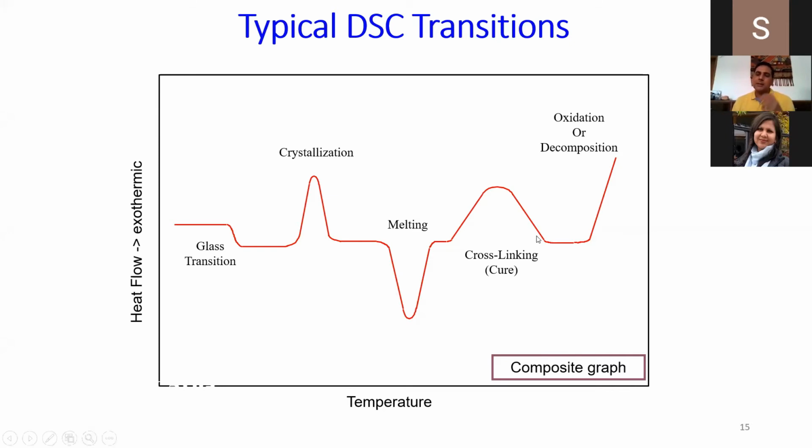So if your target is just to test your sample for the Tg only, don't go for excessive heating. Depending on the behavior or property you need from the sample, just heat until that particular point. Don't directly go beyond, let's say directly to 400 degrees Celsius. What will happen is everything will melt, get converted into vapor, and spill out onto your furnace. You are going to damage your equipment. So that should be taken care of.